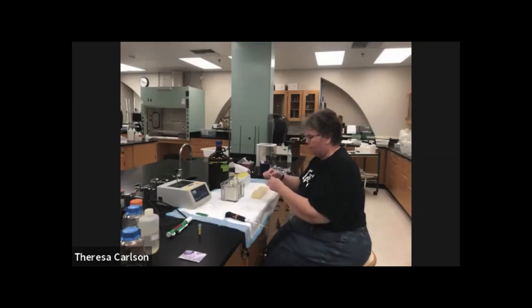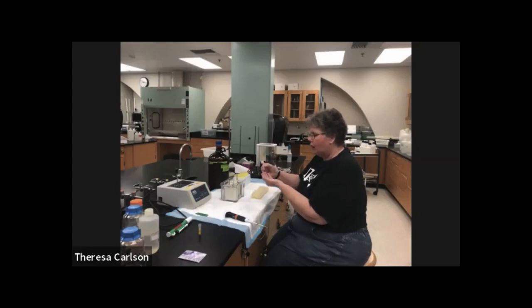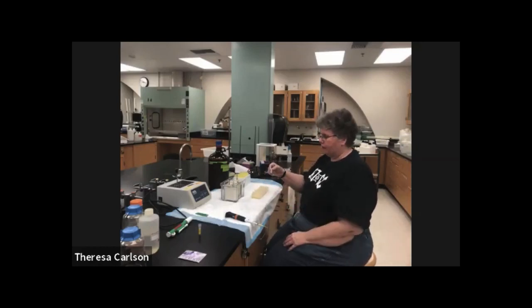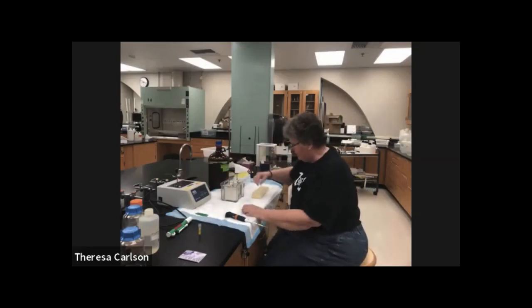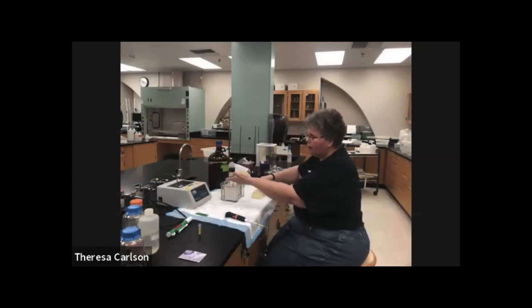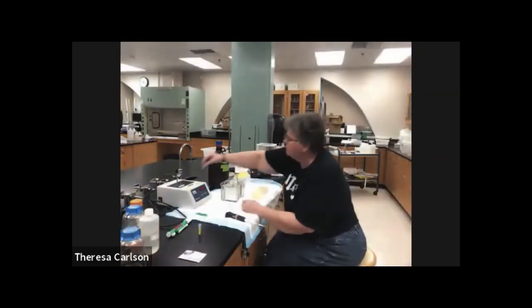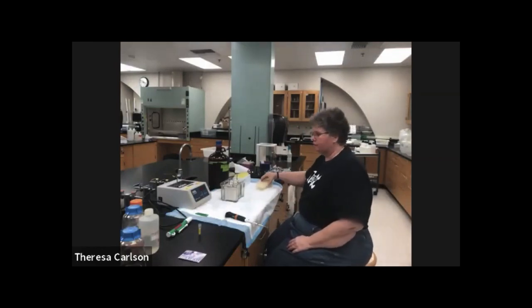So we're adding, and of course there's buffer in there. So we've added equal volumes of protein to our 2x SDS sample buffer, meaning the final concentration is 1x of sample buffer inside each one. So now we're going to put them in a 95 degree heat block for 3 minutes, approximately 95. If it's a couple degrees less, it's not the end of the world. So 95 degree heat block for 5 minutes.